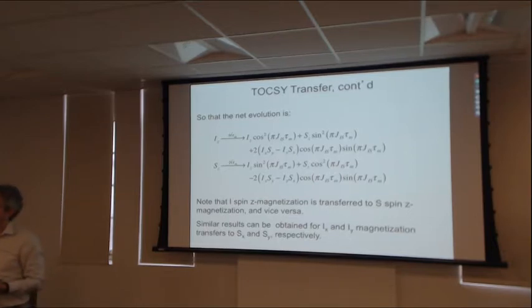And that means, first of all, we don't have to worry about the dispersive tails. And secondly, we have in-phase multiplets. So as the molecule gets larger, the multiplets don't start to cancel each other.